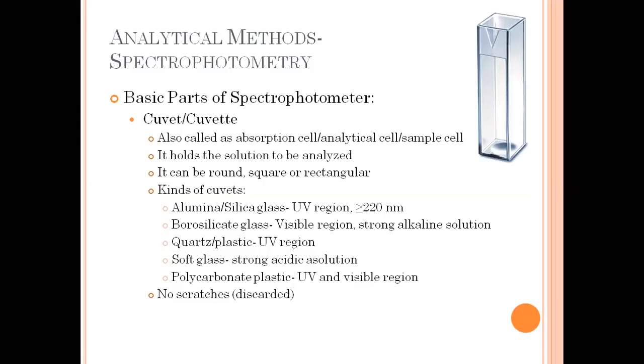Okay? So kindly take note that there should be no scratches on the surface of our cuvettes because that can result in scattering of light, and that should be discarded.